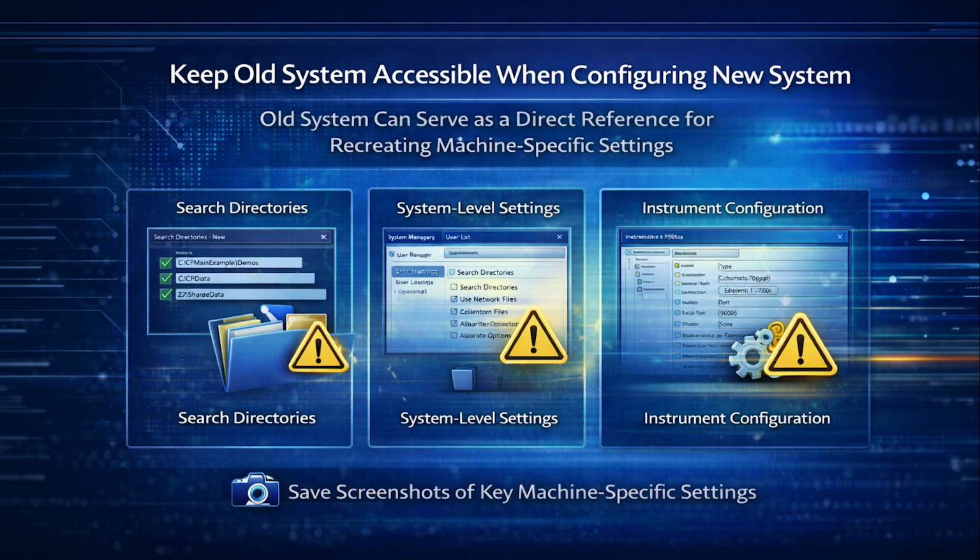For data acquisition systems, instrument configuration must also be recreated. Acquisition services, instrument definitions, data directory assignments, and other hardware-related settings are tied to the local machine and cannot be copied. Registry-based settings and service-level configuration must be rebuilt on the new system.